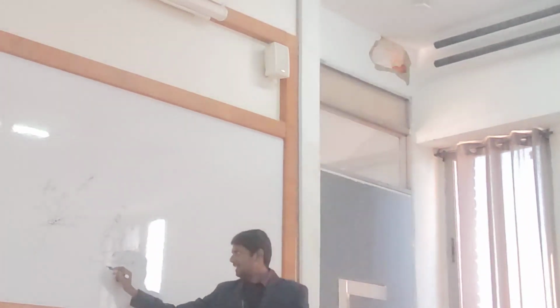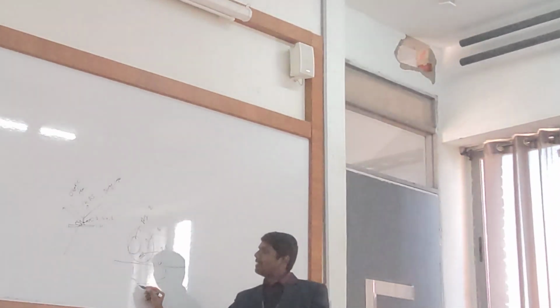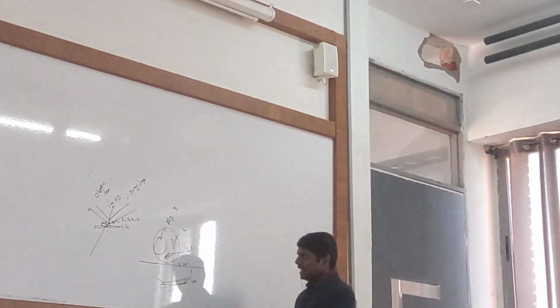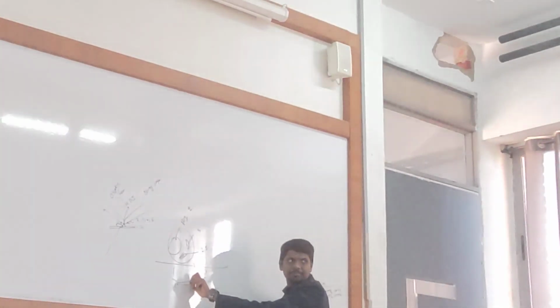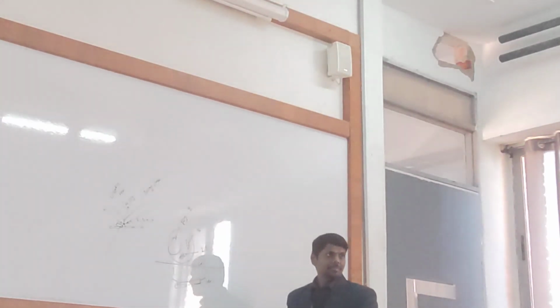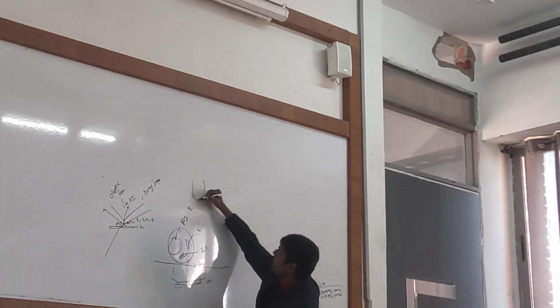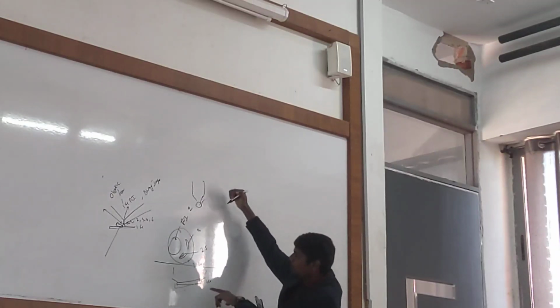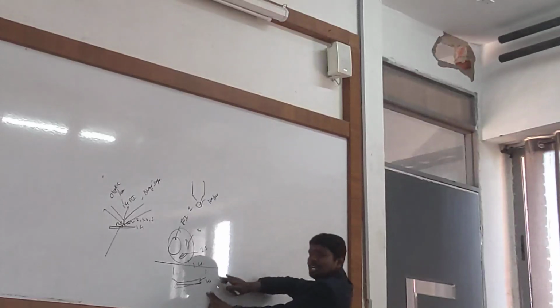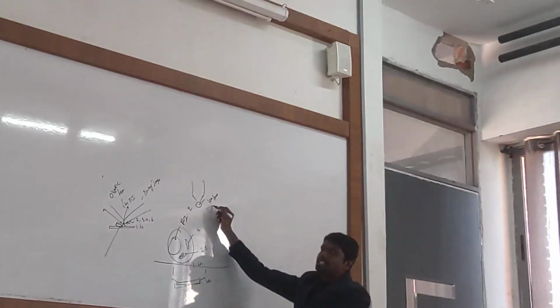Now, I can do one interesting thing. Below the specimen, near the condenser, I will keep a specialized lens. This lens will bend the light. And there is one more lens near the objective lens. I can take two specialized lenses, maybe some specialized mechanism in the diaphragm and in the objective lens.